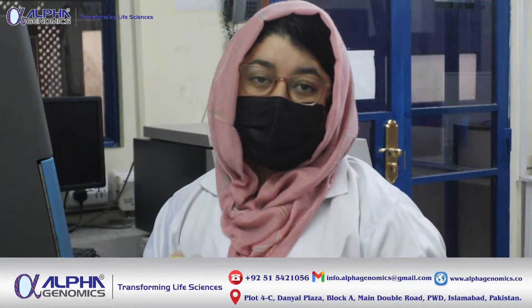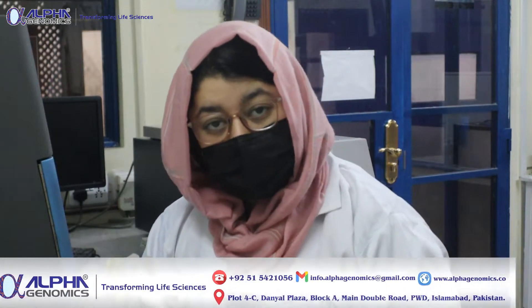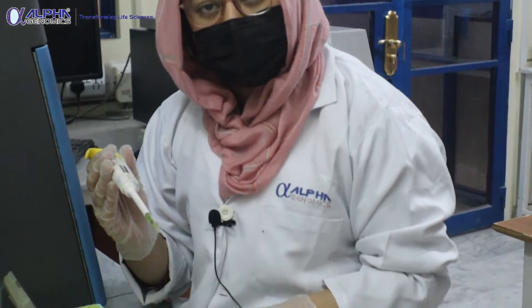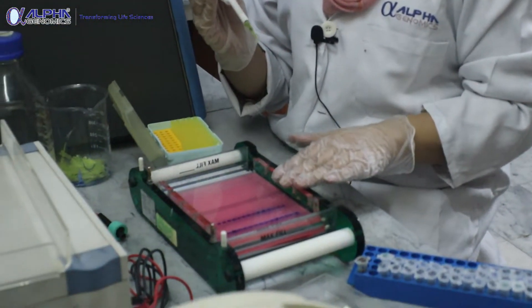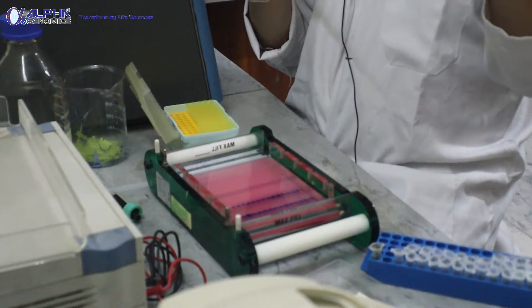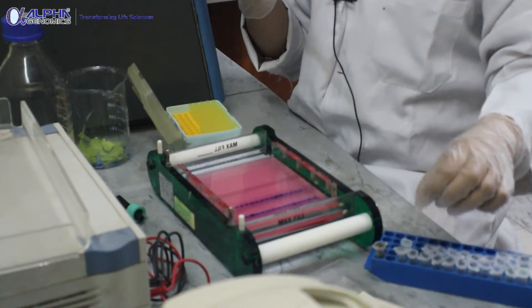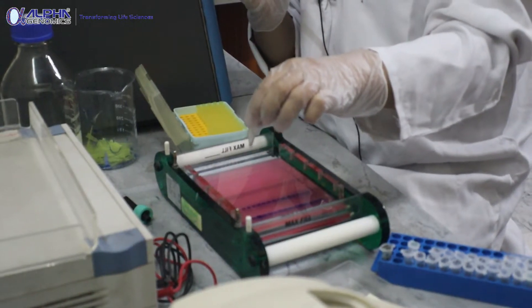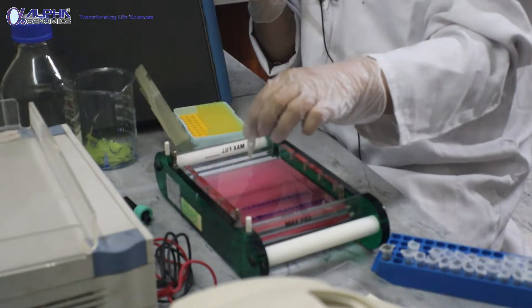Right over here I am running 1% agarose gel for DNA qualitative analysis. The DNA I have already extracted and it is kept in this TE buffer - it is dissolved in TE buffer.